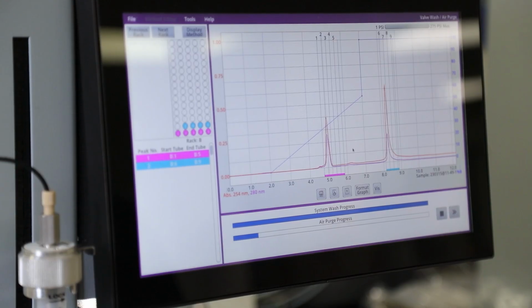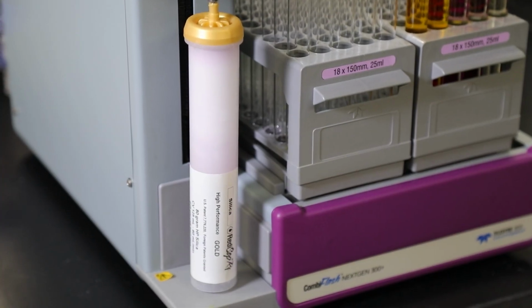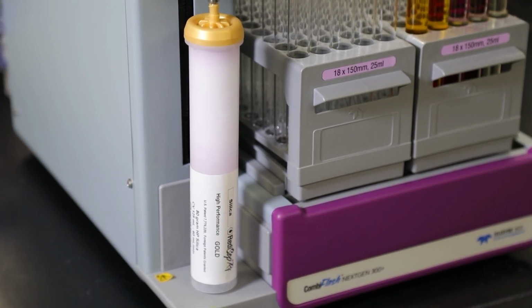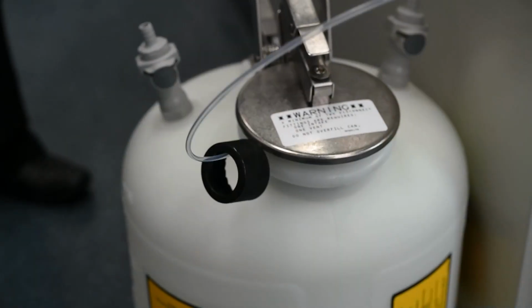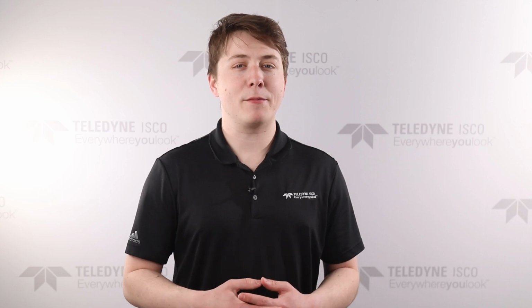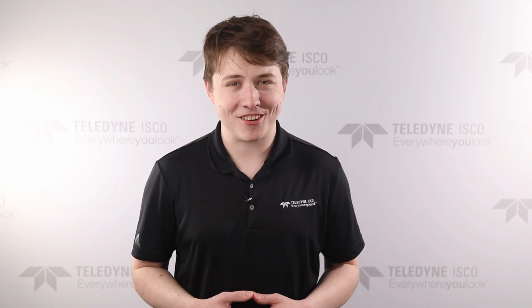At the end of the run, the system goes through the cleaning process, washing out any fluids and purging remaining air from the system. All waste travels through the system into a designated waste container. And that wraps up our flash chromatography demonstration. This was just an introduction, but we hope it has piqued your interest.